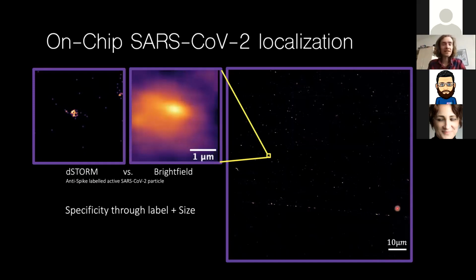So here you can see the coronaviruses we measured. These are active coronaviruses, and that was quite nice because you can easily measure that with a cell phone, because you can just bring it in once. It's in the range of less than €1,000, and then you can do all kinds of things. And of course, it will never leave the lab anymore without damage, but it can stay there and produce nice images. And so now we have the size, so you can really resolve the particle as a roundish particle with some 150 nanometer in size, as at least we think so.